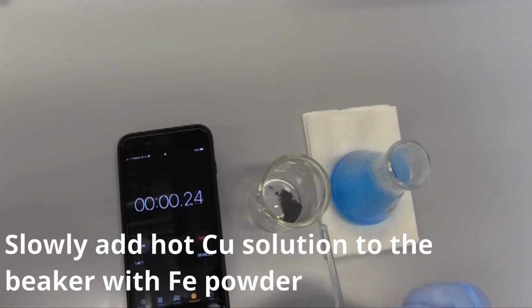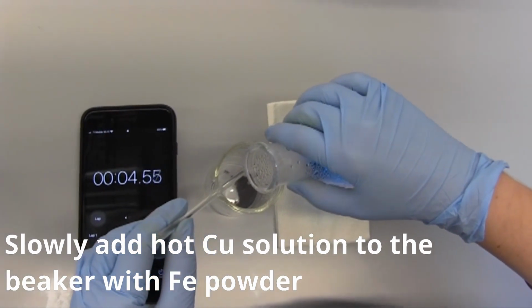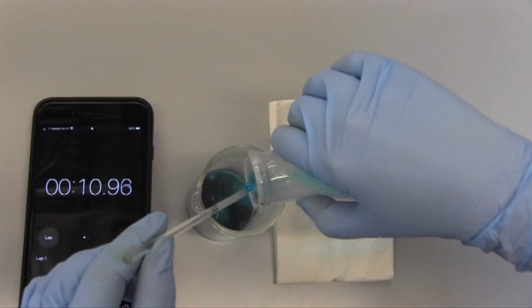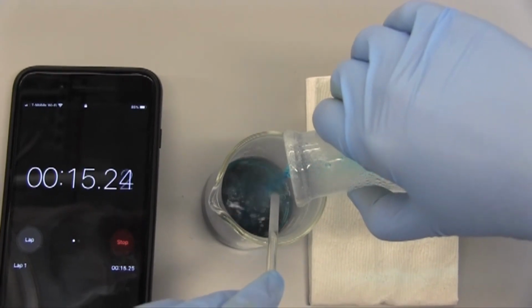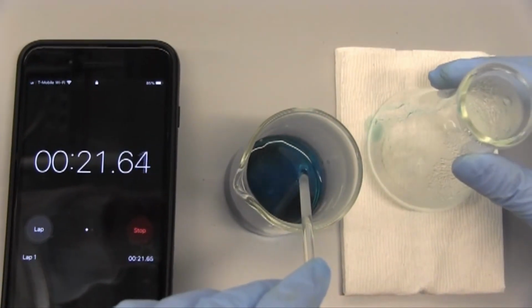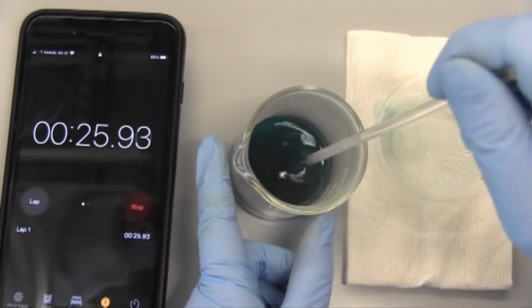Slowly add the hot copper sulfate solution to the beaker containing the iron powder. Stir the solution to ensure completeness of reaction.